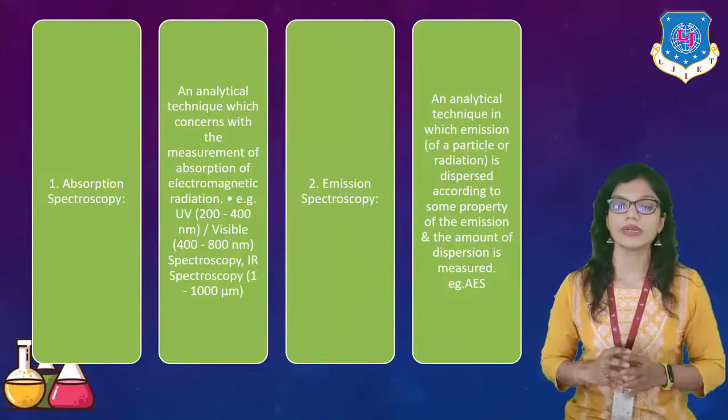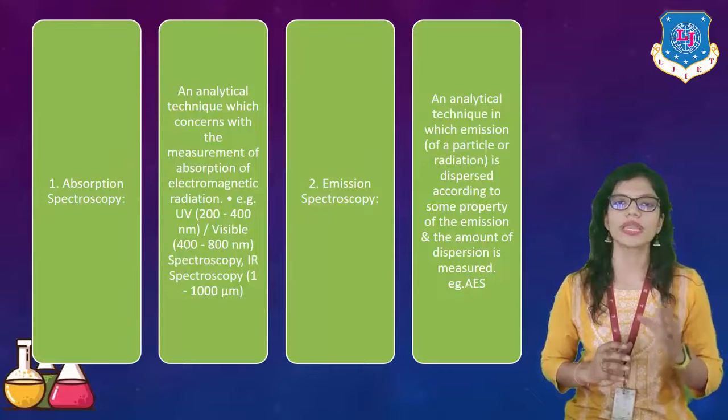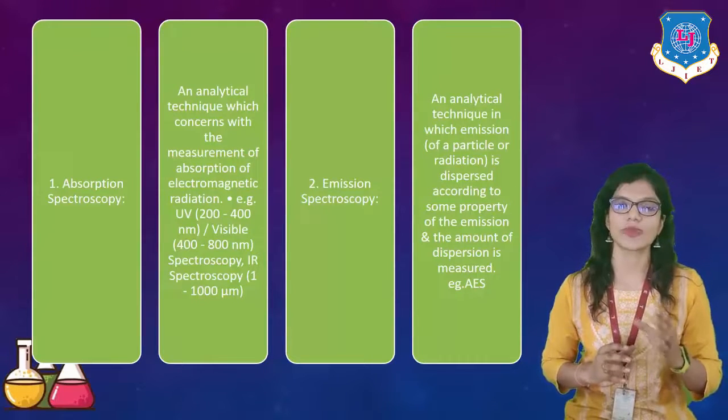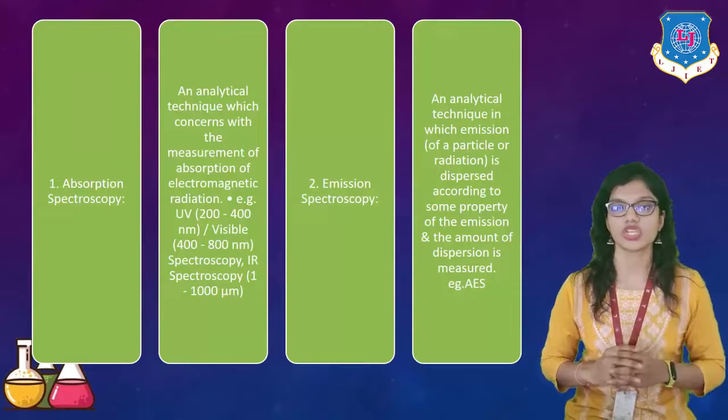An analytical technique which concerns the measurement of absorption of electromagnetic radiation is known as absorption spectroscopy. As I said earlier, each and every element is individualistic in nature.